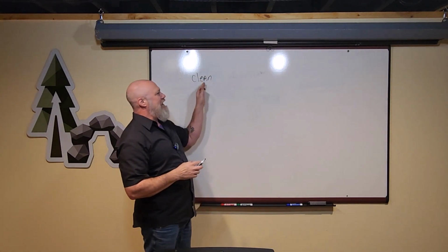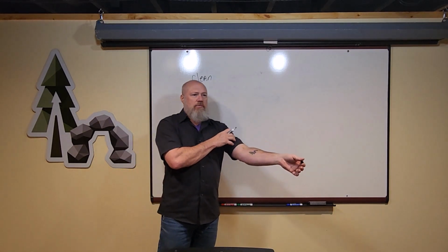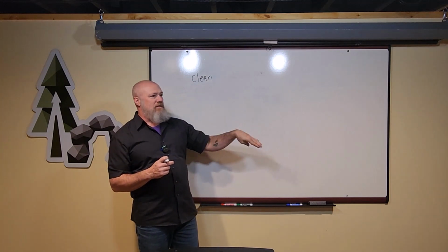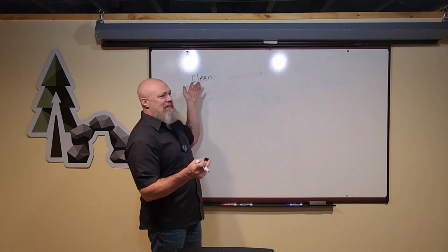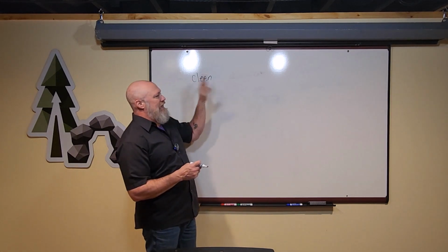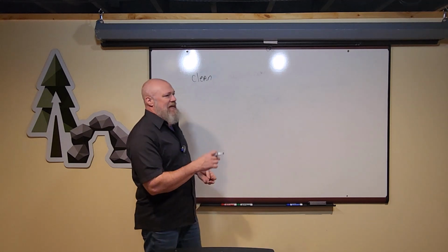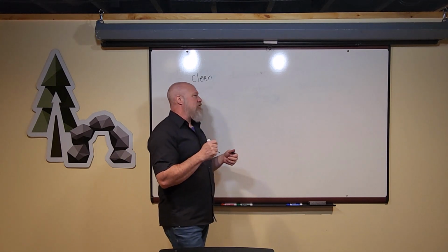Clean is just removing the fat and fascia and connective tissue from a structure. So if I say we're in the flexor compartment of the upper limb, I'll say clean and tag the biceps brachii. You will go from the proximal attachments to the distal attachments, sometimes called origin insertion. I don't care for that use of terms, but I'll say clean and tag this structure in your dissection outline. You'll clean all the fat and connective tissue so that you can see the muscular fascicles, the surface of the muscle, and then you will tie your tag on either the distal or proximal portions, and then write biceps brachii, muscle or tendon of, or something, whatever I ask you to label it as.